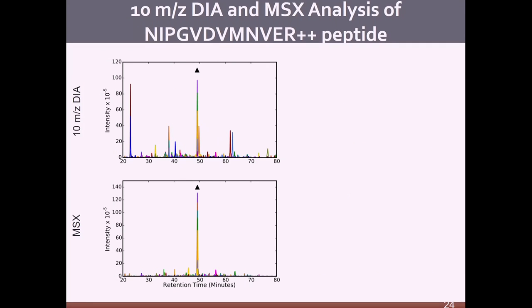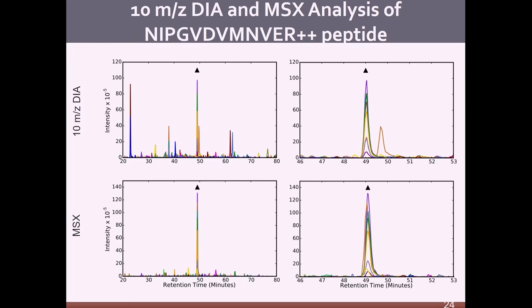And here's just another example. But it's the same basic idea. And no matter how many examples you look at, it's always kind of exciting to see that the demultiplexed data looks way cleaner than the multiplexed data.